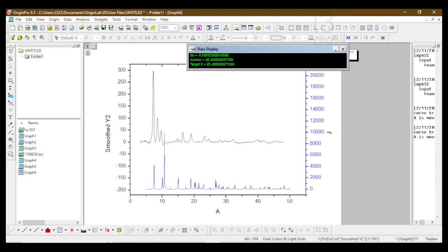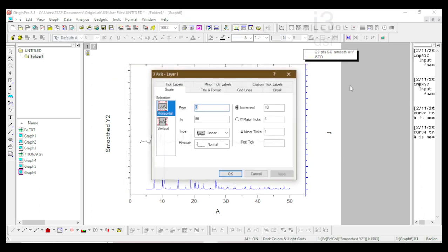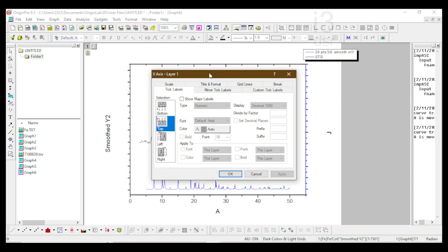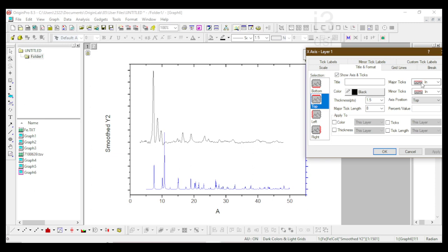So I have moved it, and now you can generate a data spectrum. Put here as none, major ticks as well as minor ticks applied. Clean. Not one, none, because the scale is no longer valid because we have got two different intensities.